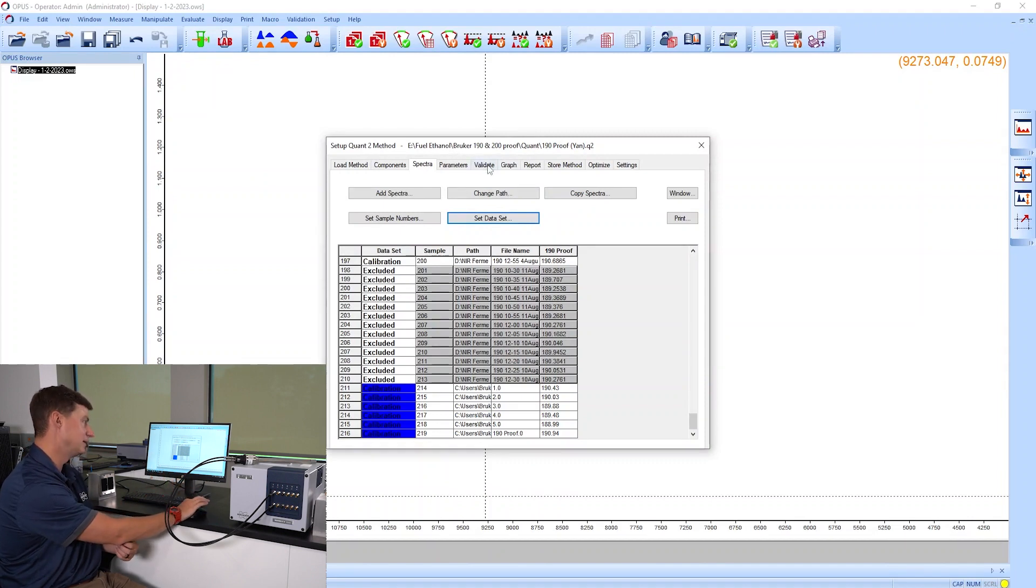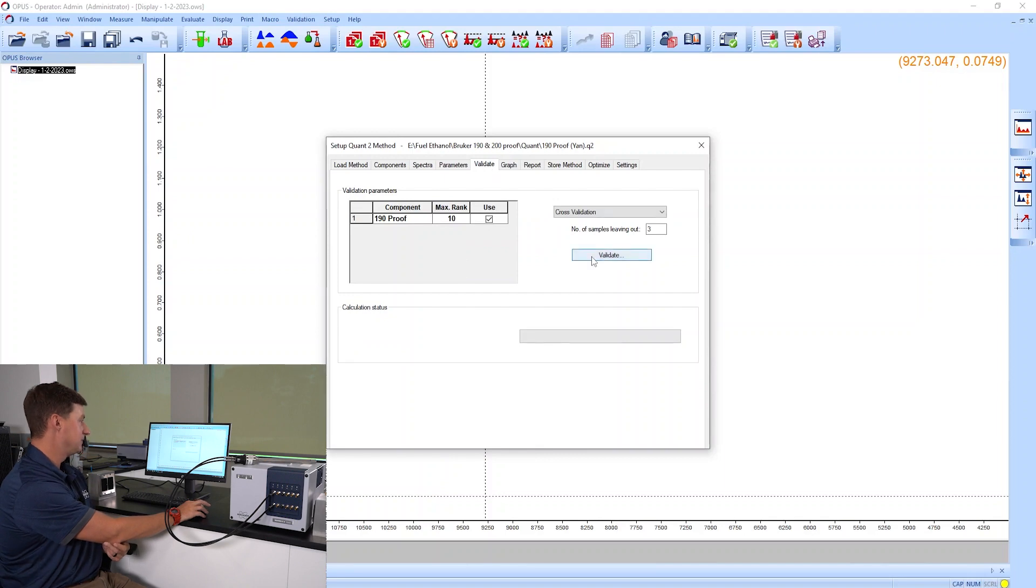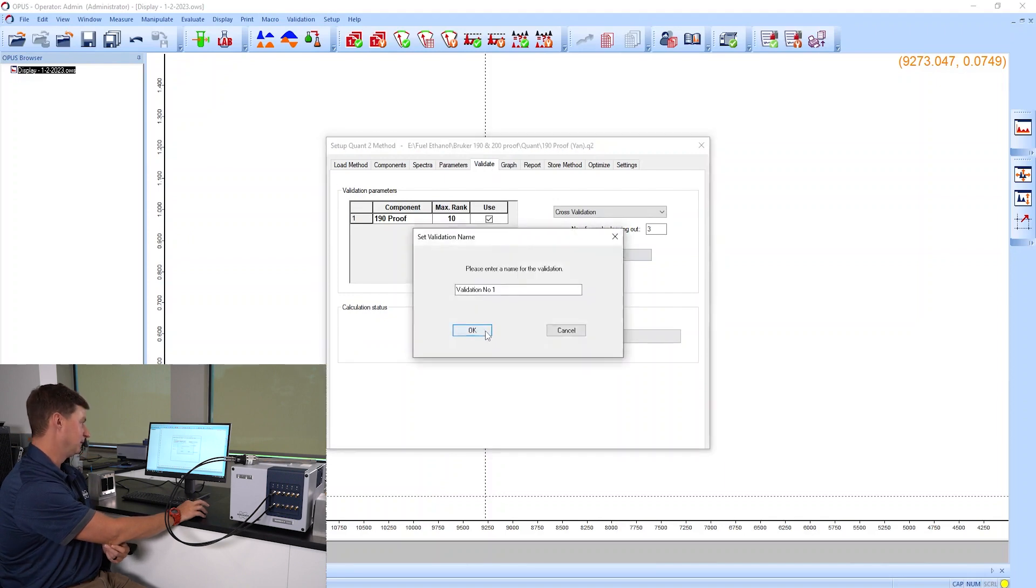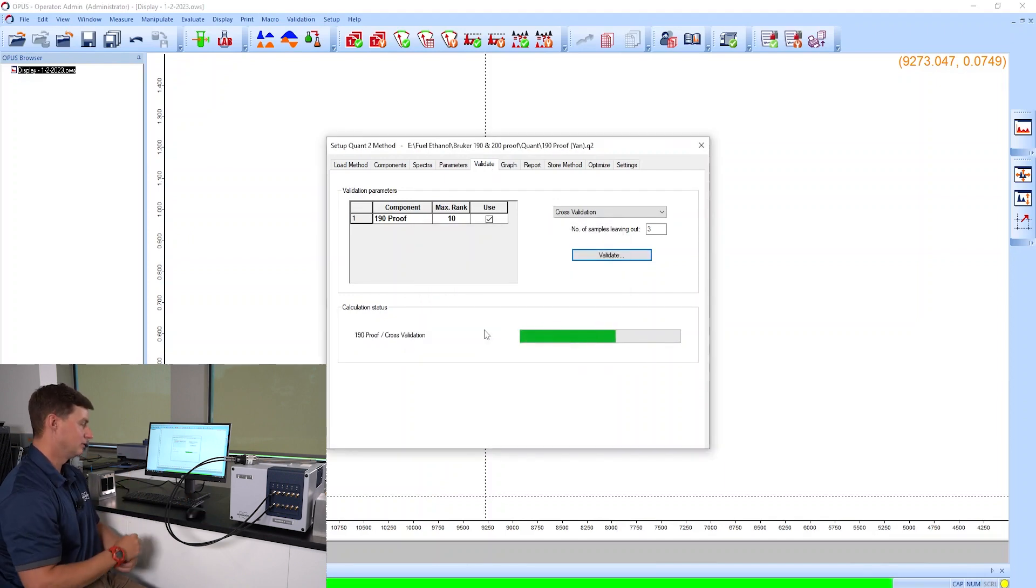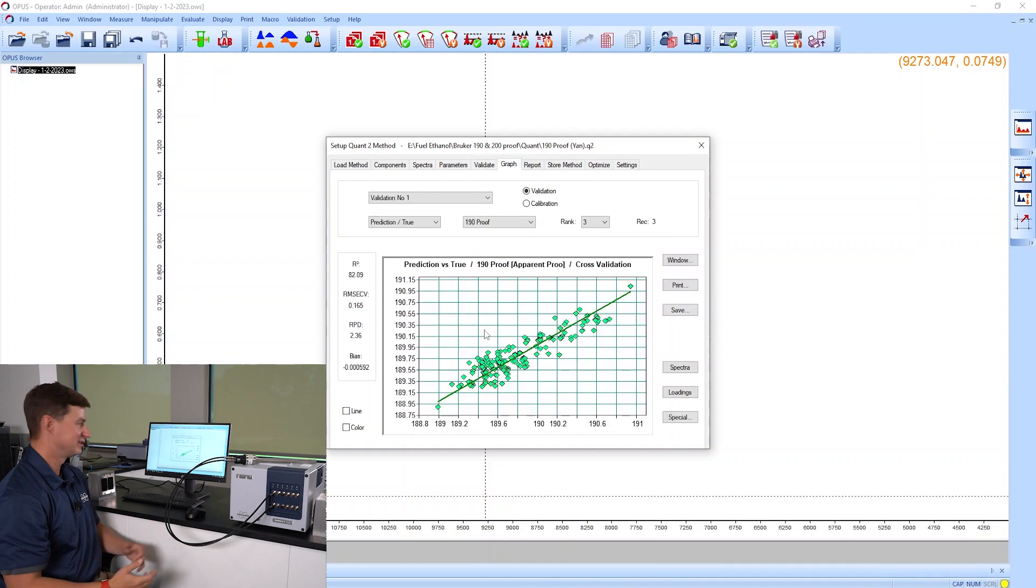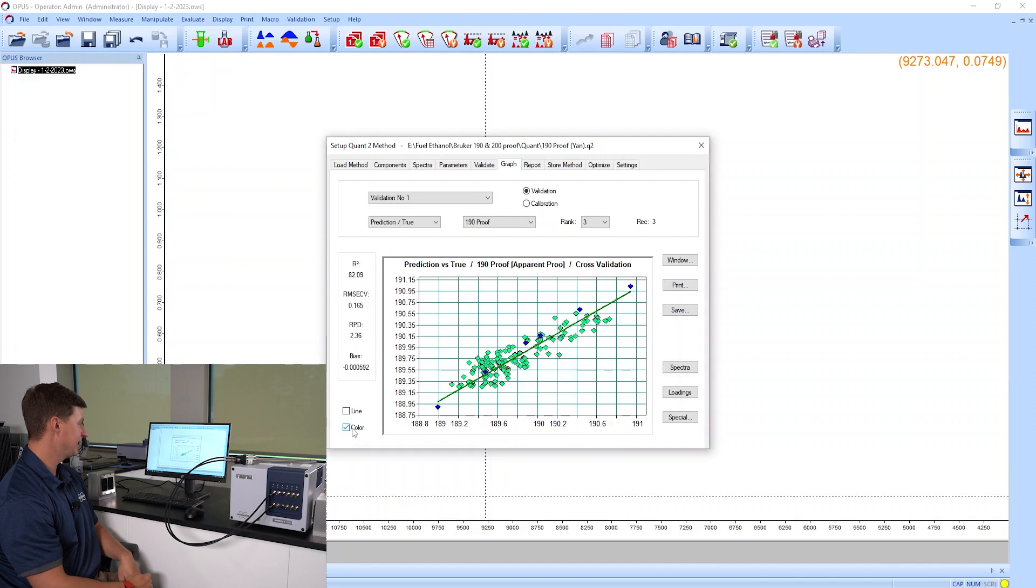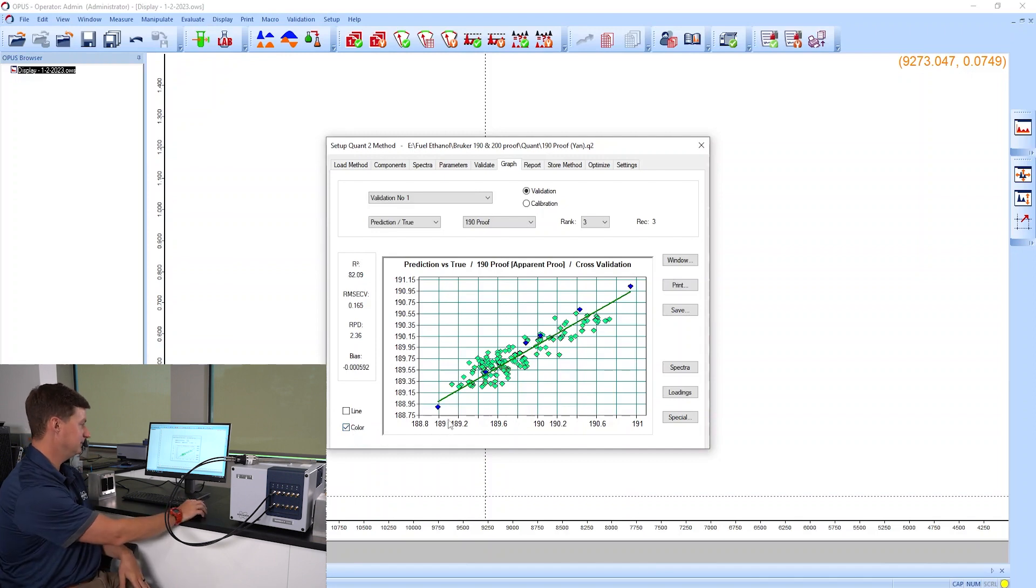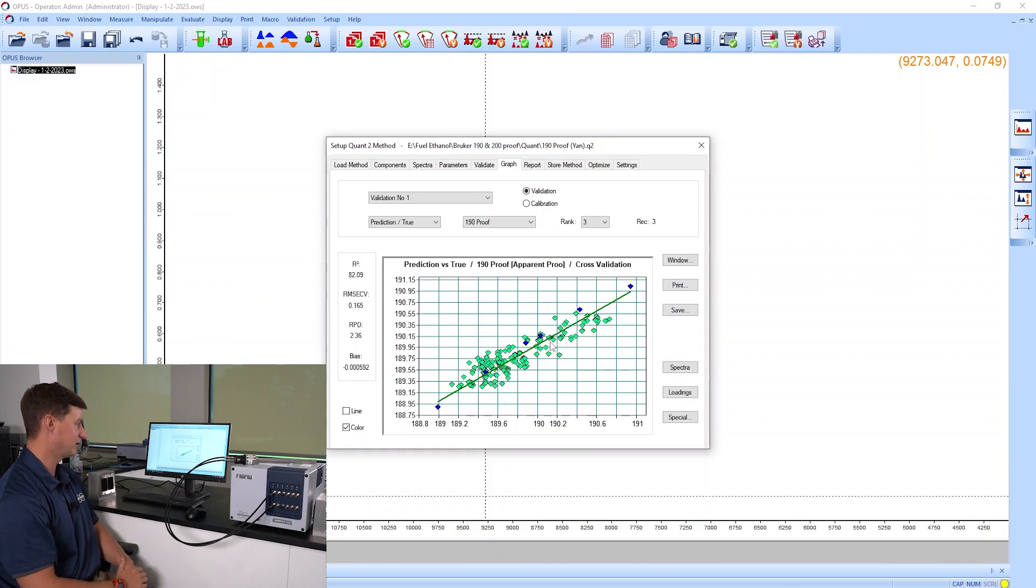My first step, I'm just going to go to my validate tab and click validate, which is going to build the calibration with the process spectra included. If I click on my color tab here, I can now see the six spectra spread throughout the range of our calibration.